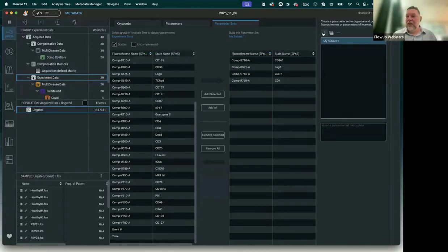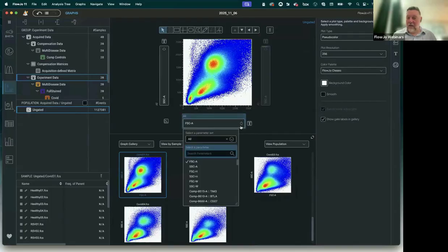All right. And you can create new parameters. You can duplicate and modify this. You can delete this parameter set, right? It's the only option here, but parameter sets allow you to make subsets. And contextually, if we go back here, and I'll get back to this, we can now choose my subset 1 and only the parameters in that subset are there then.